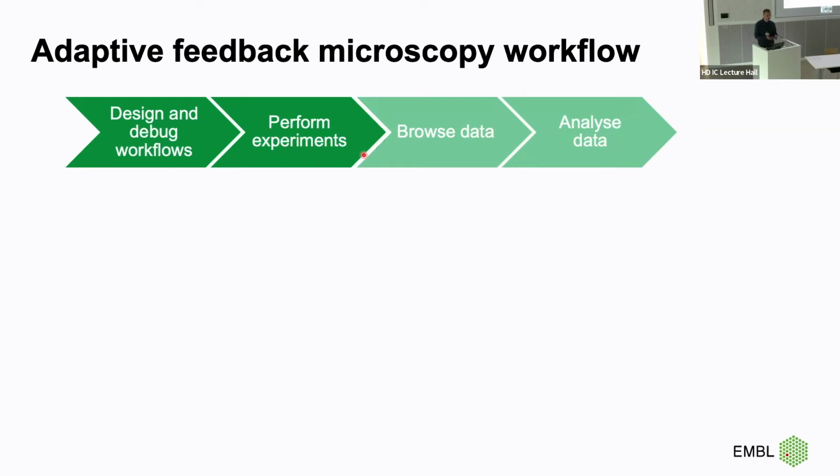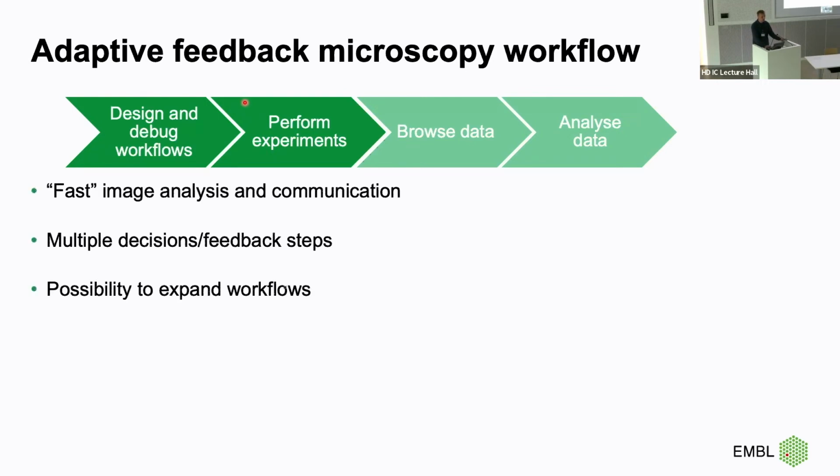Then we want to perform experiments, right? To collect all the data which are needed for the follow-up analysis. And then later on, we want to be able to browse and analyze the data in a consistent manner. Right now, I will focus on the first two blocks because I think the latter two blocks will be the topic of the third session. And I would first try to think conceptually about the requirements, right? Which I have to ask each particular user or in each particular project: what are the criteria for the tools I would select in the end?